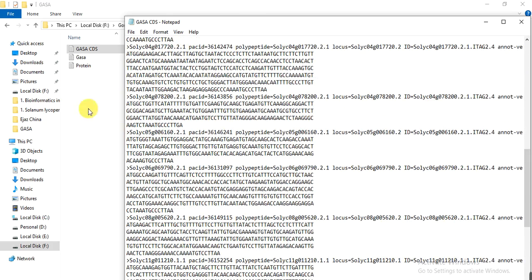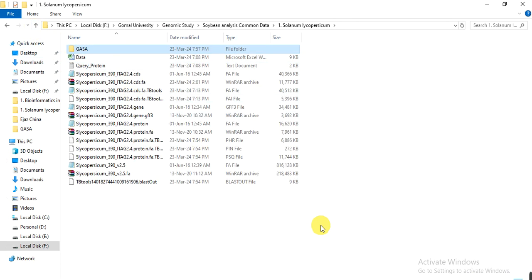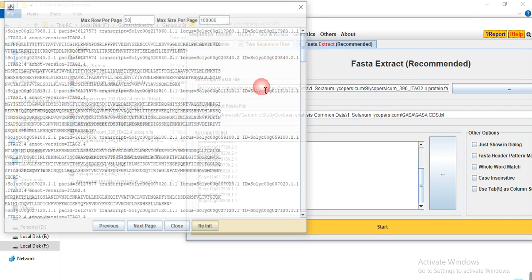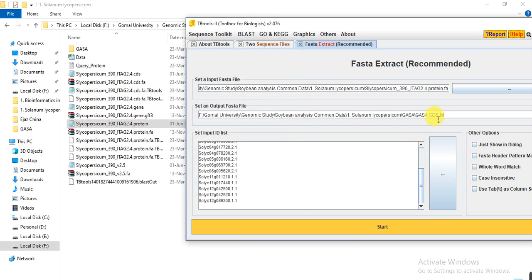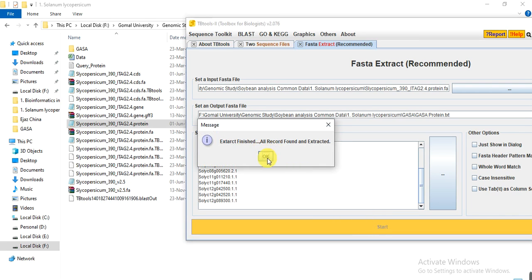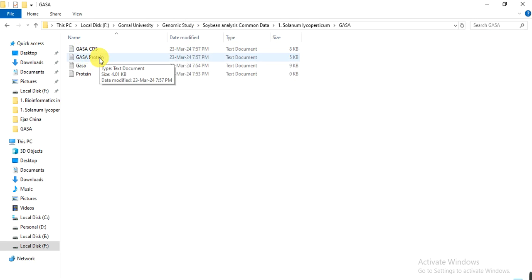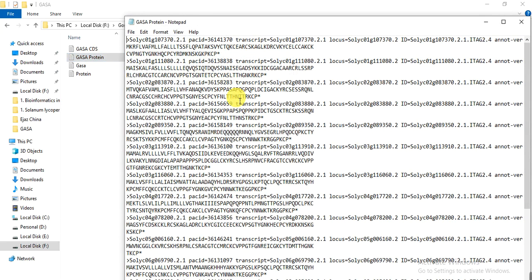These are the CDS sequences of all our GASA genes from the genome of Solanum lycopersicum. If we need the protein sequences, we take the protein file as input. Give the same output directory but change the filename from CDS to protein. The transcript IDs are already given. Click Start and the protein sequences are extracted.